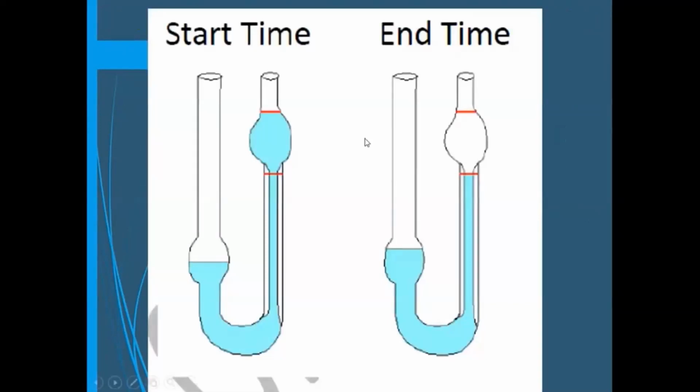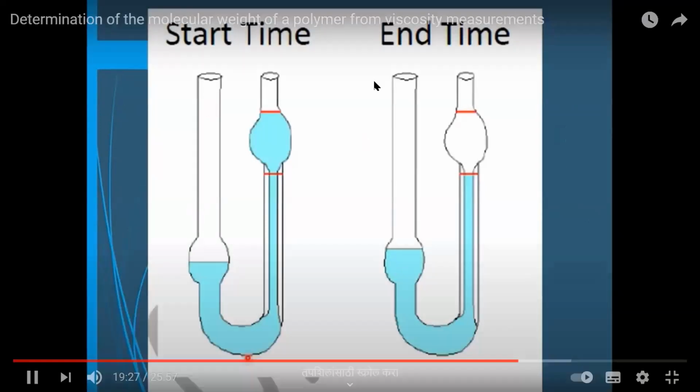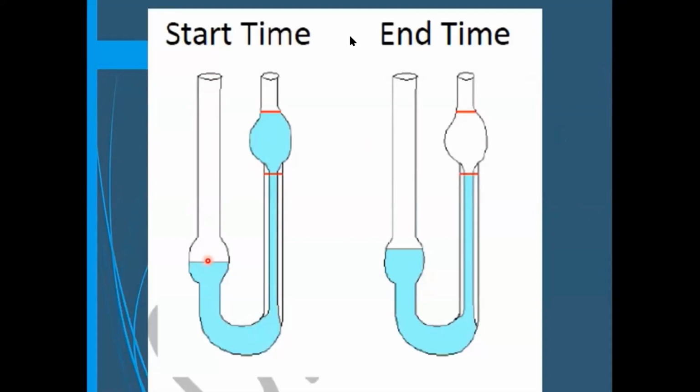Dissolve all the polymer particles inside the volumetric flask to have 25 ml as a volume.